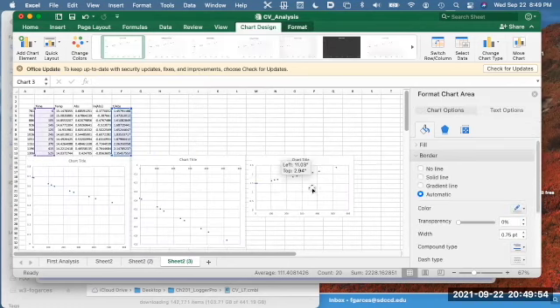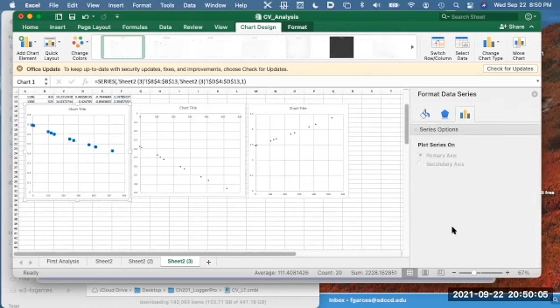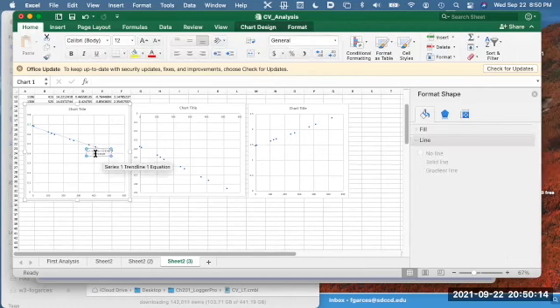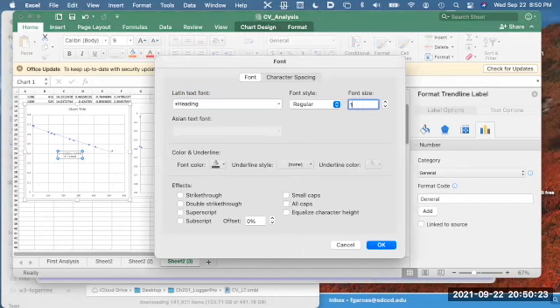And then I'll go ahead and fix the title, the font size, and making sure that the natural log absorbance versus time, the x-axis has the proper display that's towards the bottom, not at the top. So what I did next, I didn't actually fix the font, I just generated a trend line. But you already know how to fix the font from the previous discussion.